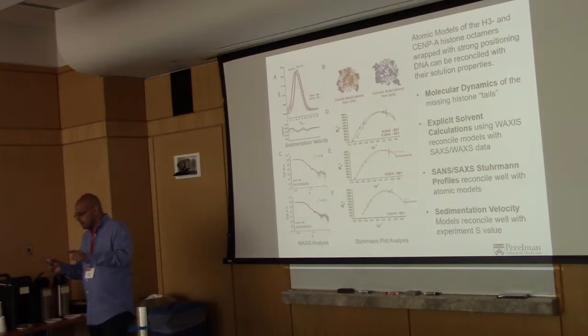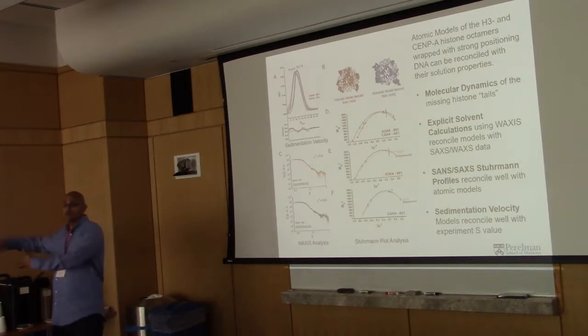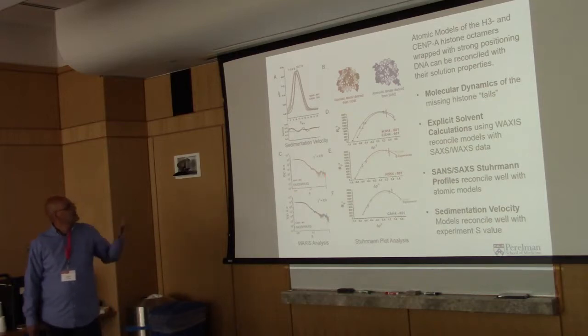If you do the explicit solvent boundary calculation, without using any approximations, and then check it against SAXS-WAXS data, you can get very good correlations between the canonical model and the solution scattering experiment. We were happy with that in that regard, although there are some aspects of X-rays that are a little bit misleading, which I'll get to in a minute.